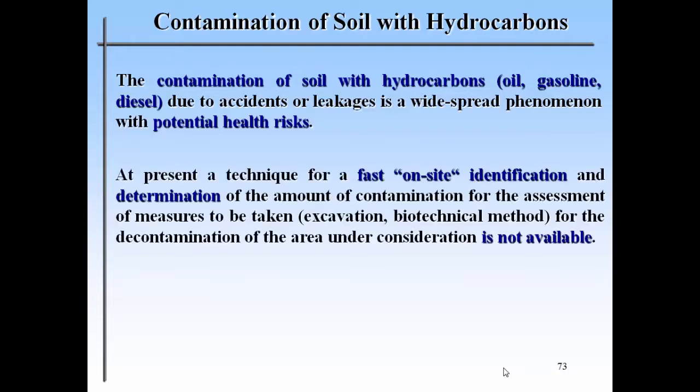At present, for fast on-site identification and determination of the amount of contamination, you have to rely on laboratory methods. And the question is, because the remedy measures to be taken are either biotechnical methods or excavation methods, if it's too serious, you would like to know, and you would like to know it quickly. How much do I have? What do I have? Is it diesel? Is it gasoline? Is it oil? And at the moment, it's difficult to find techniques which can do this on site.